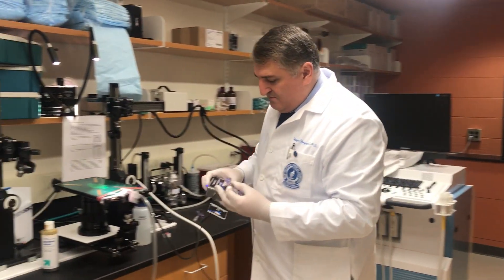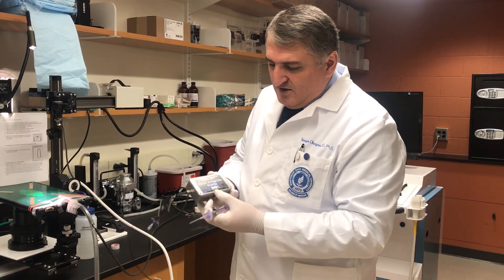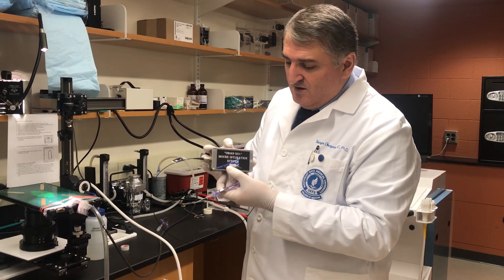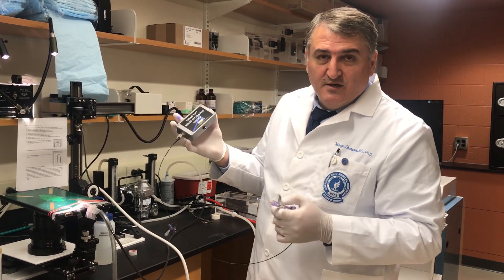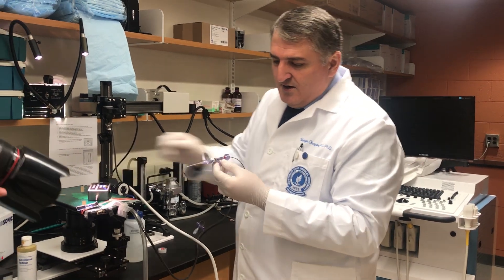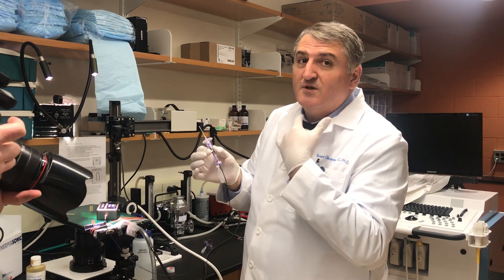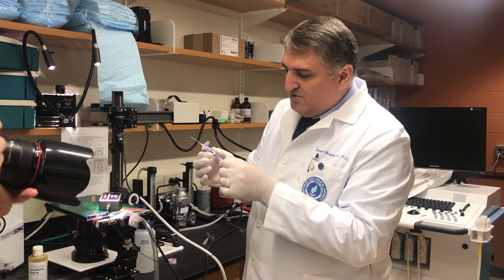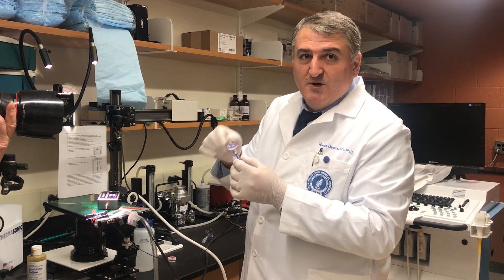So the fiber system — this intubation system — has two units. One is the light source, which is portable with a rechargeable battery that lasts up to 30 minutes. And this is the laryngoscope, which has an optic that magnifies up to five times the glottis, the vocal cord area. And we have the fiber cape, which shines light into the mouth.